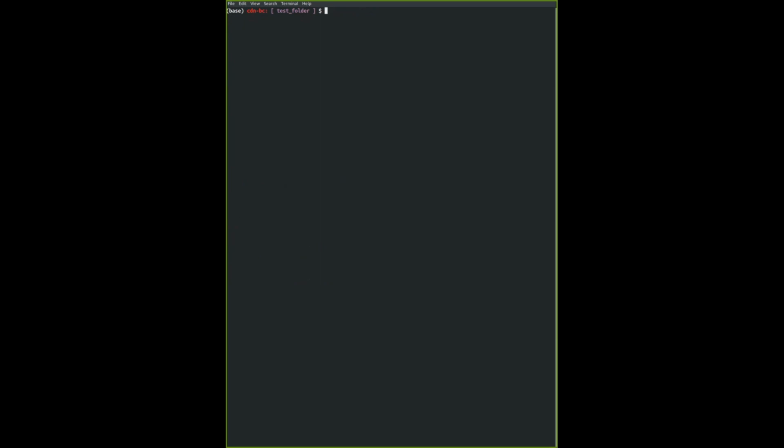Be very careful. In terminal, it's not like on Windows or Finder. You can't, not that I know of, undo anything removed. And it's not going to be in your rubbish bin or your recycling bin. It's going to be removed straight from your file system, because you're dealing with terminal. You have to be very careful what you delete. Okay. The function is rm, to remove, followed by the name of the file that you are trying to delete.